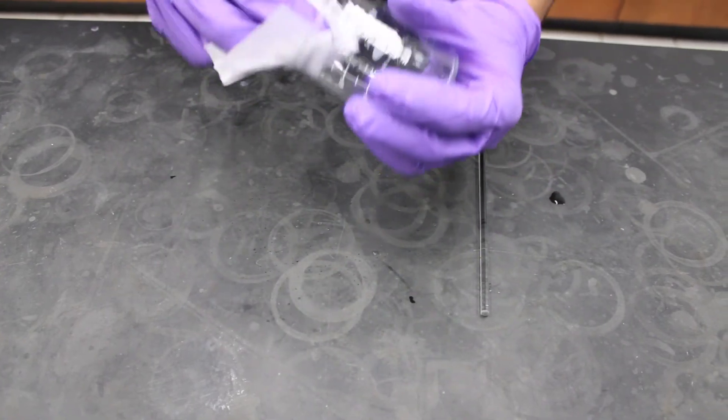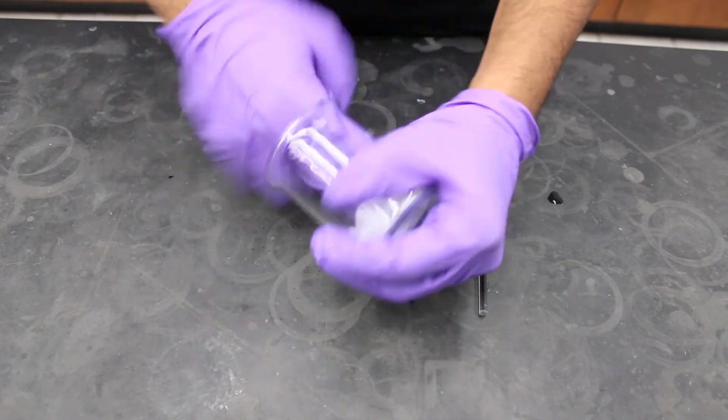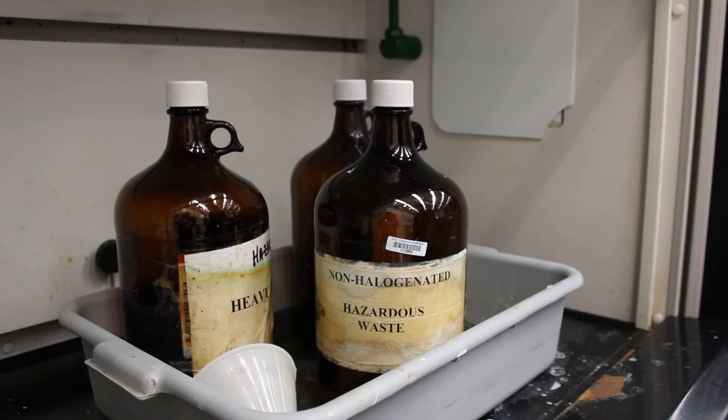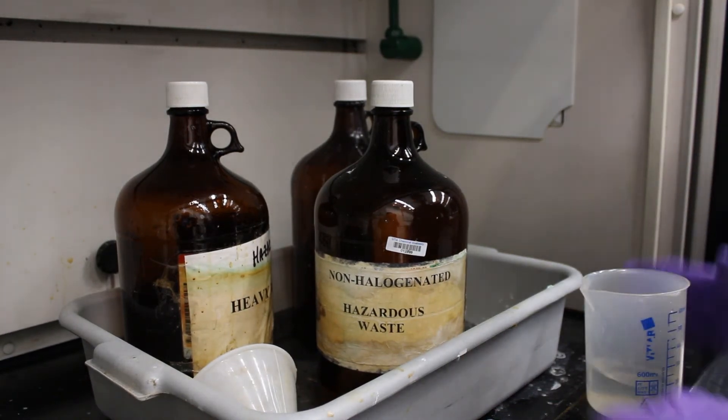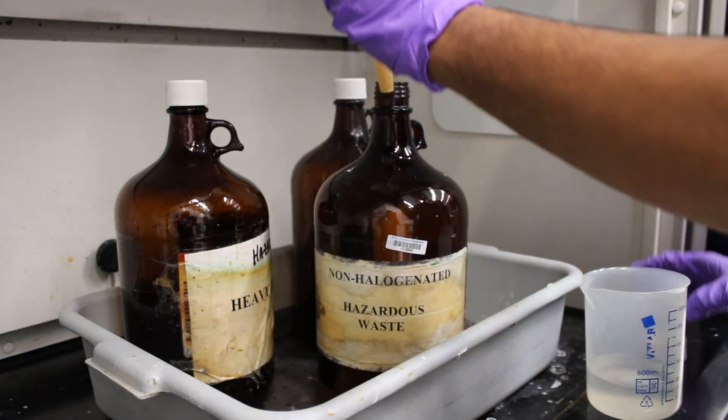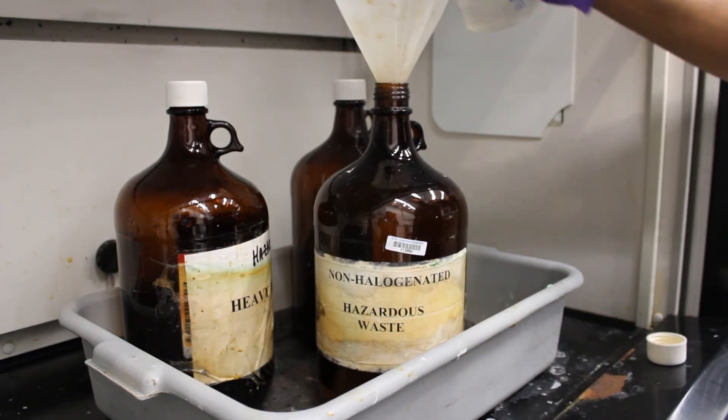Now repeat the previous steps for all additional runs while changing the mass of sodium bicarbonate each time. Once you complete all the runs of the reaction, dispose the contents of the plastic beaker into the non-halogenated waste container.